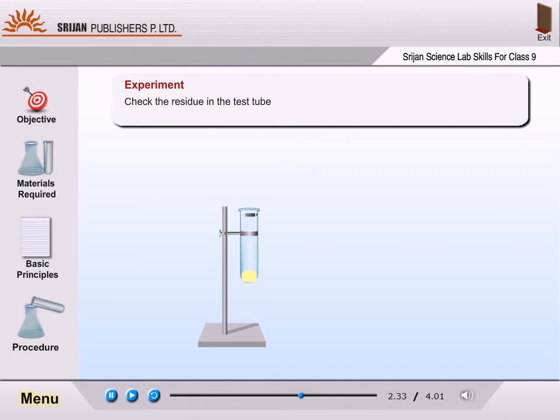Check the residue in the test tube. The residue in the test tube is yellow when cold and reddish brown when hot. The residue is lead oxide.